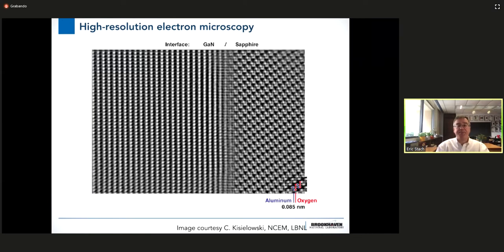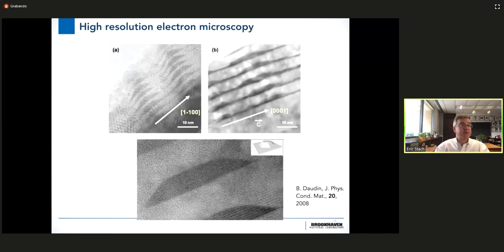But again, this type of image, a phase contrast, high resolution image, allows you to see where the atoms are in the sample. Just as another example here, you can combine the diffraction contrast imaging and high resolution imaging modes to learn even more. If you look here on the upper left, you've chosen a bright field image in one condition, in the upper right, a bright field condition in another area. You use this again to look at the types of defects that are present.